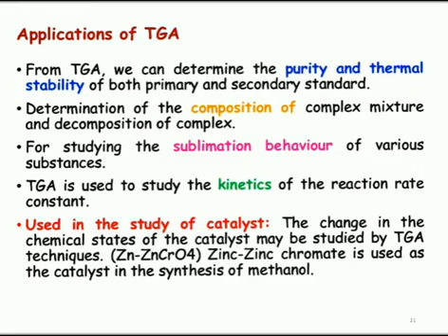Also, we can study the sublimation behavior of various substances using thermogravimetric analysis. We know what sublimation is: when you heat a substance, a solid goes directly into the vapor state, or vice versa. That is called sublimation.